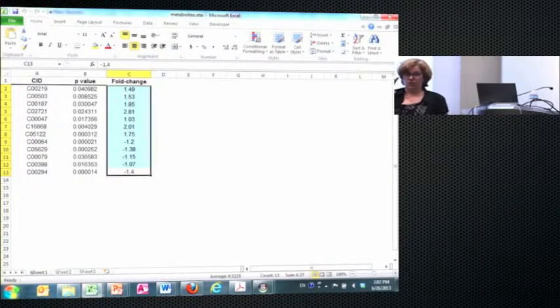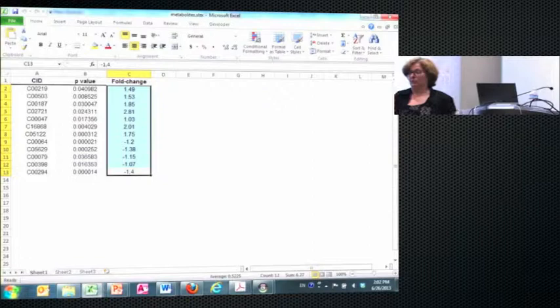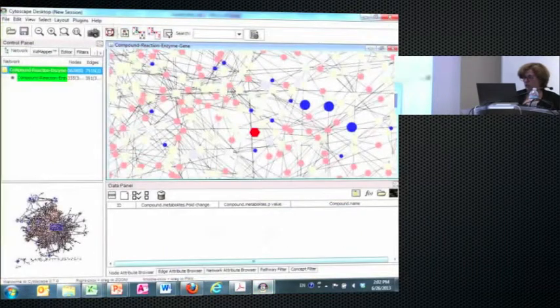Instead you would have the actual, maybe normalized measurements for, let's say, three different groups, control and two treatments, each with three or five time points. You can put all this data in, and I wasn't actually planning on showing that, but that's how you would get to this animation.